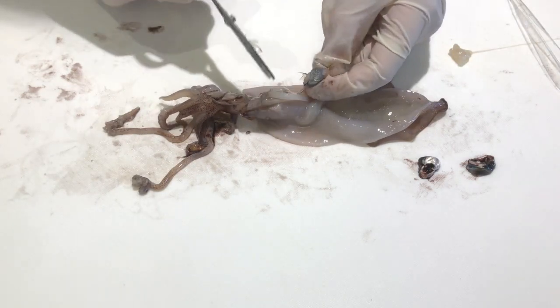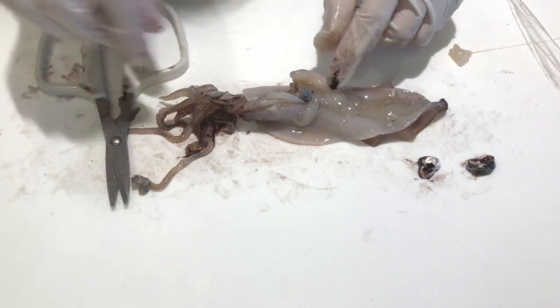Then I removed the ink sac, the silvery structure right in the middle of the squid's body.